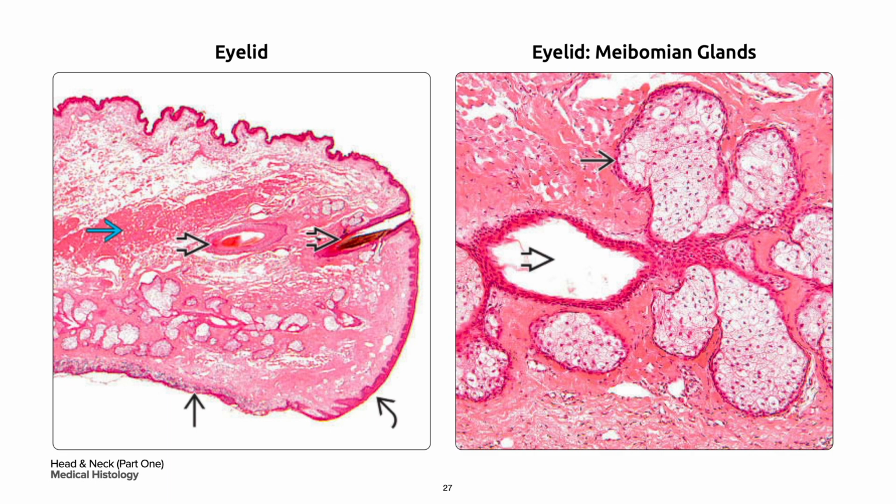in bold black arrow. On your right is one of the most abundant types of glands, the sebaceous meibomian glands in single black arrow, which are found in the tarsus of the posterior portion of the eyelid. Here, the acini of the meibomian glands are seen in association with a central duct in bold black arrow.